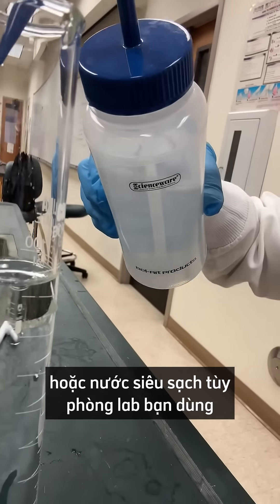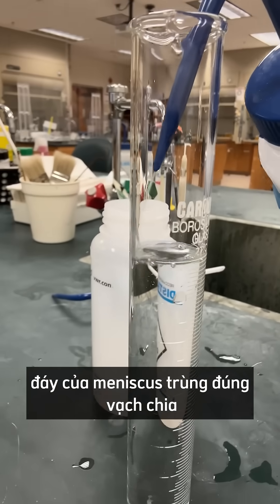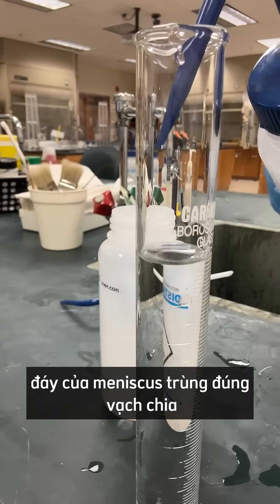Your good water — your Milli-Q water if you have it — and now you want to go until the bottom of the meniscus is right on the line.